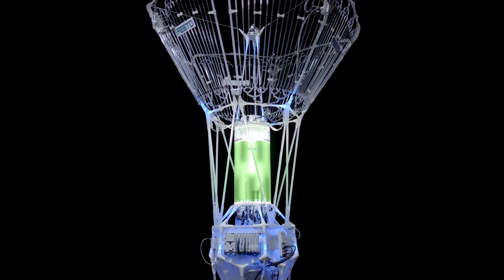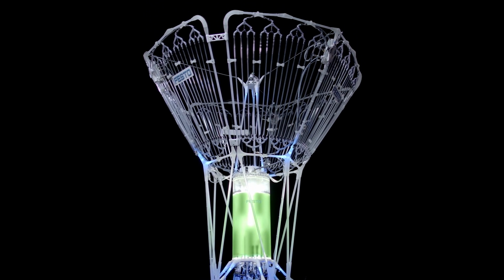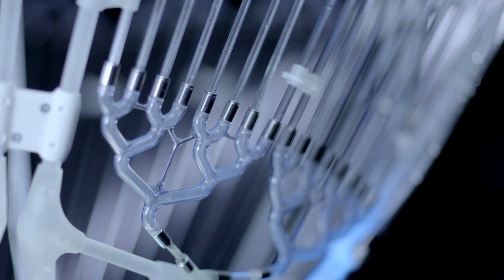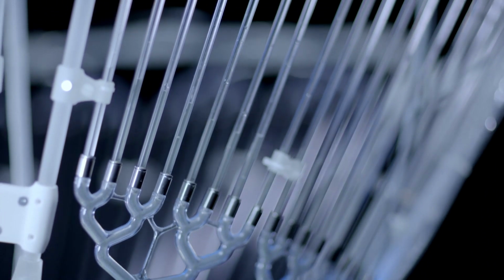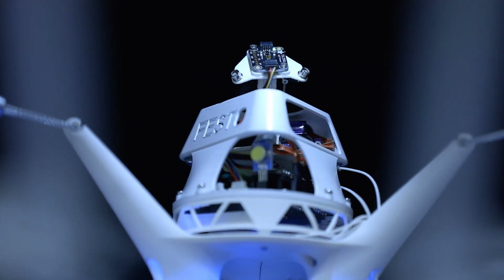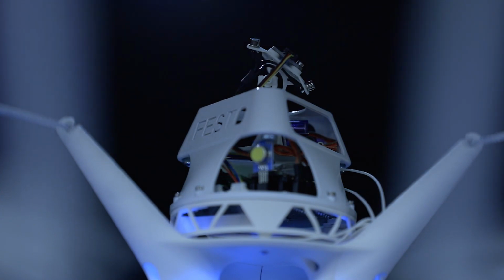And the main purpose actually is to bring our automation technology to scale up and to make the process energy efficient and grow the algae as efficiently as possible. And therefore we also pump the fluid into a collector to increase the surface to catch the light, or to collect heat or absorb heat depending on the weather conditions.